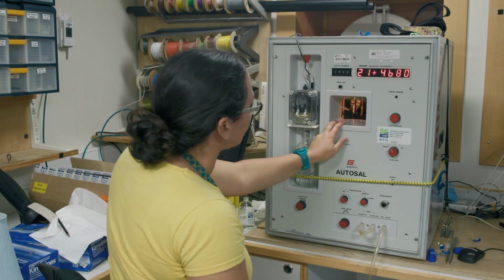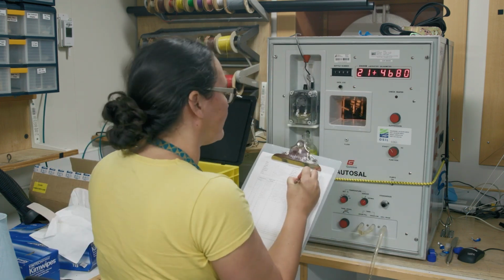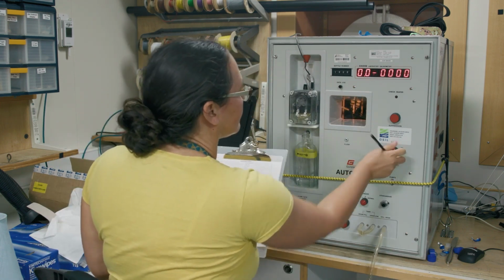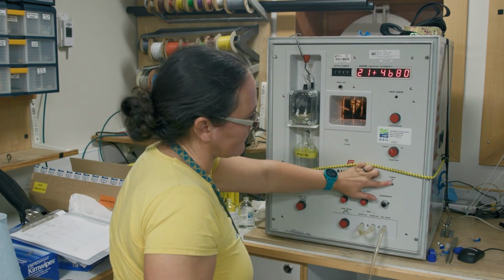We switch to standby, record the final standby value, then to 0, record that value. Neither has drifted significantly from the start. Finally, we switch off the internal pump as well, but leave the salinometer on to keep the bath temperature ready for the next set of samples you need to run.